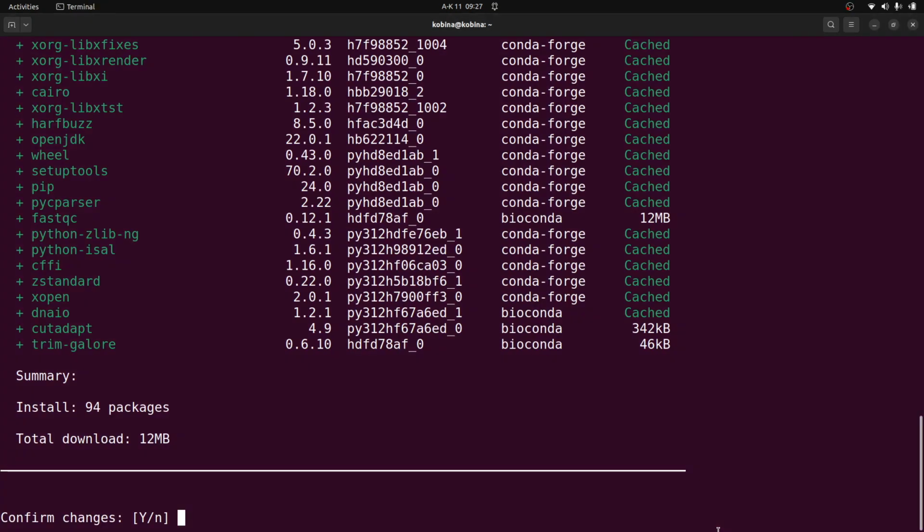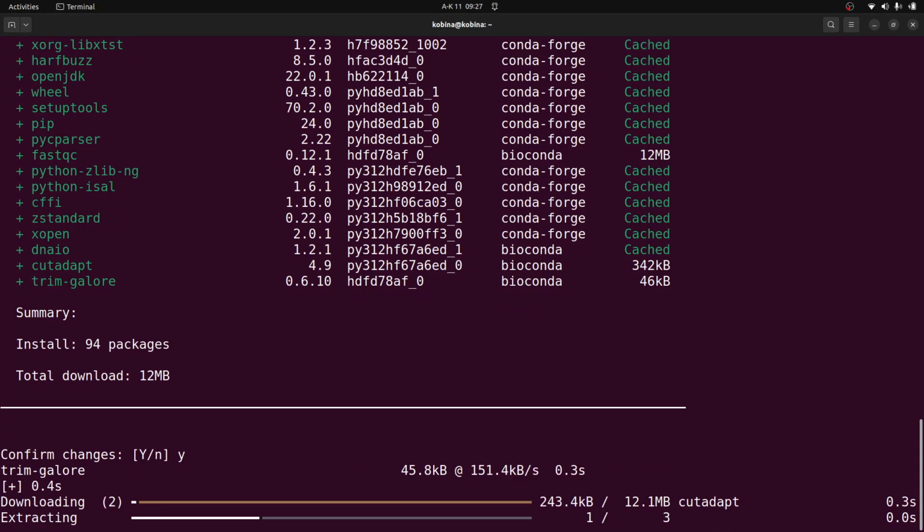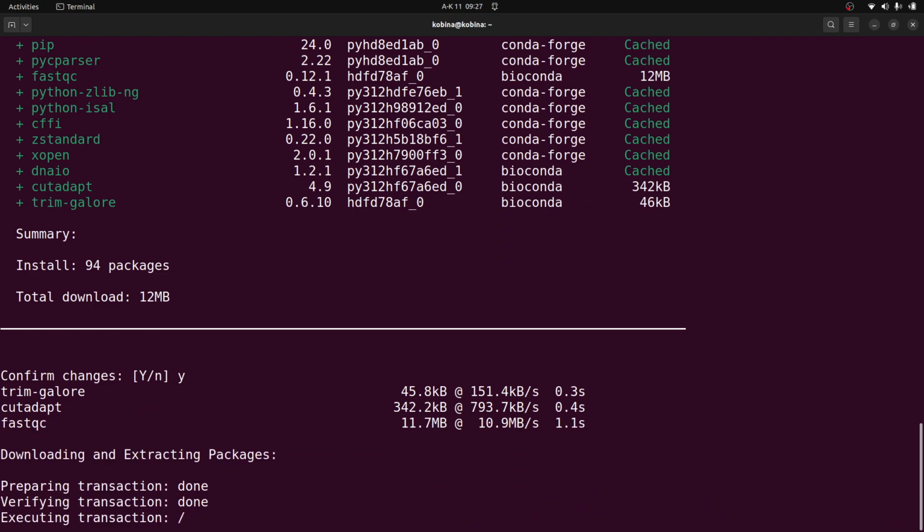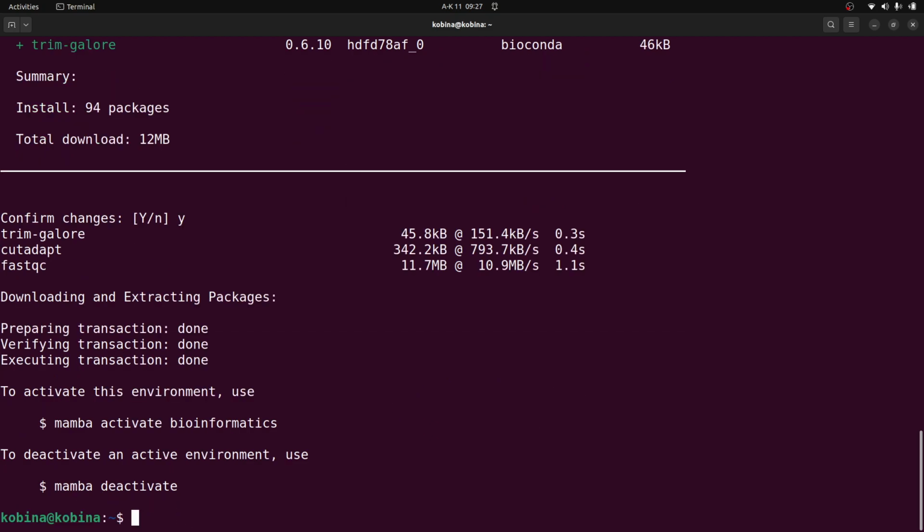All right. Now I'll type Y for yes. And once I do that, all the necessary packages will be downloaded and installed for us. Okay. So it's quick. It has been done.